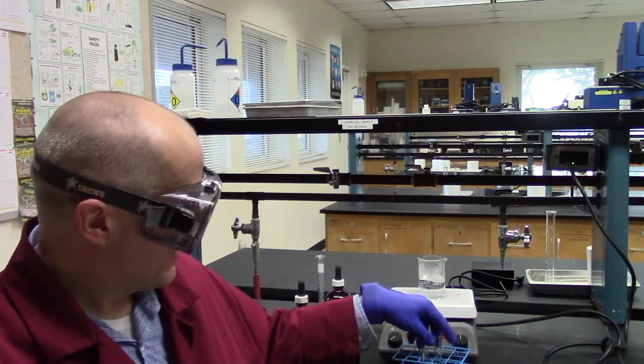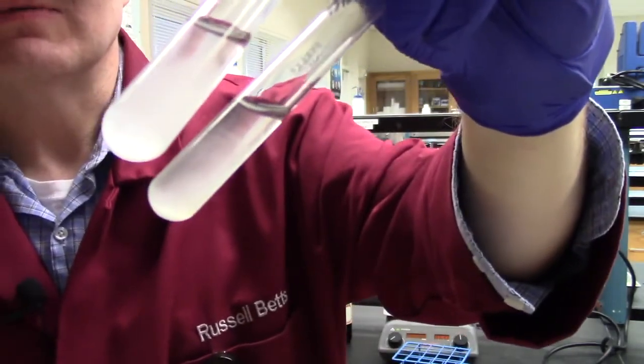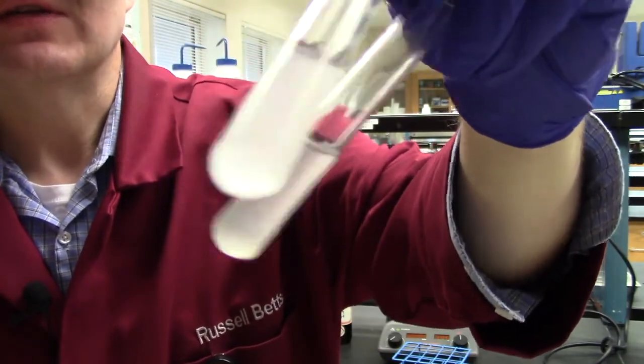Hey guys, let's continue on with our experiments with carbohydrates. Now we're going to do the hydrolysis of a polysaccharide. I've got 2 test tubes filled with starch. Let me grab them for you. There you go. As you can see, starch is basically more or less a cloudy type suspension. This is kind of how they look.